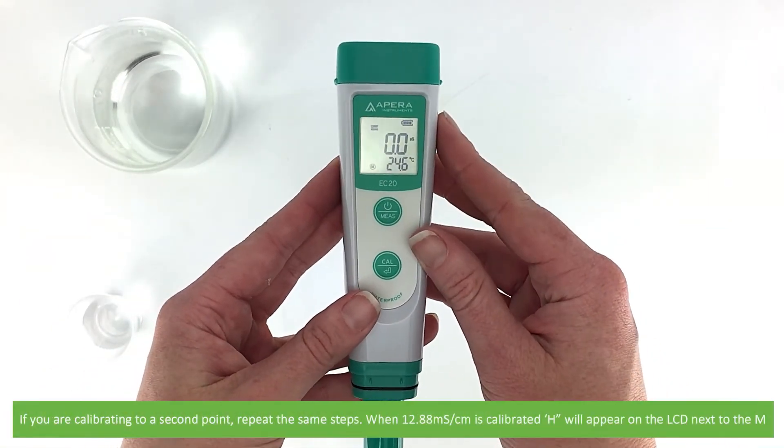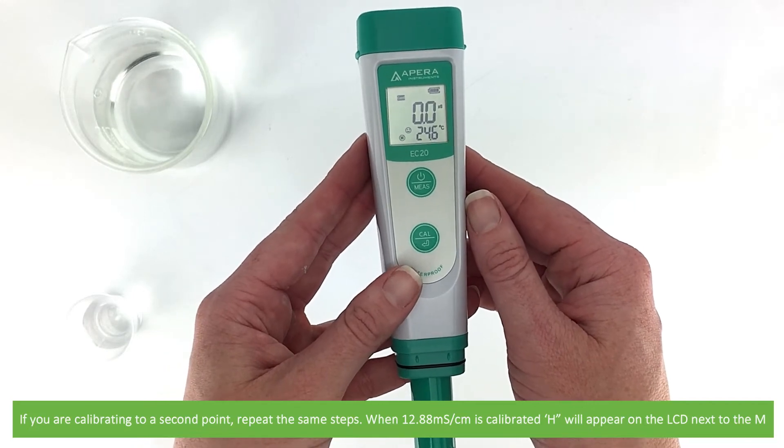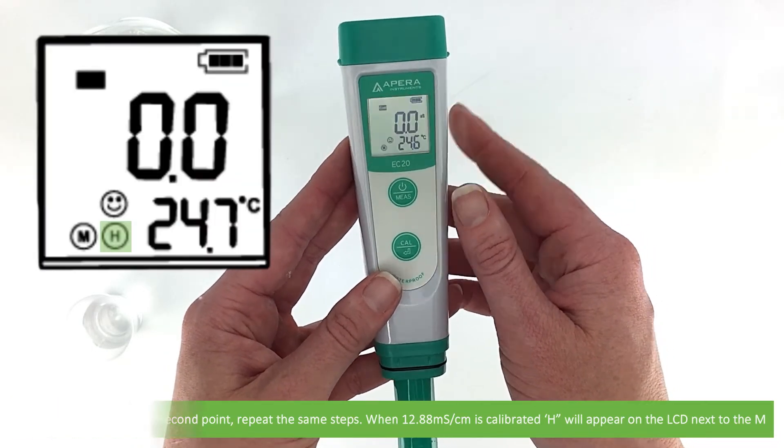If you're calibrating to a second point, repeat the same steps. When 12.88 millisiemens per centimetre is calibrated, a small h will appear on the LCD next to the M.